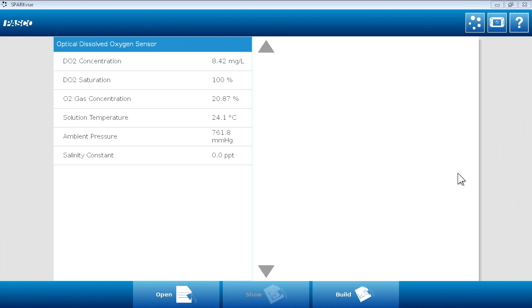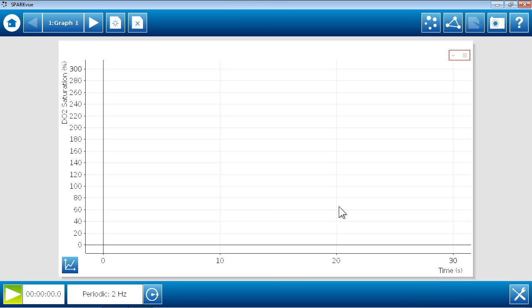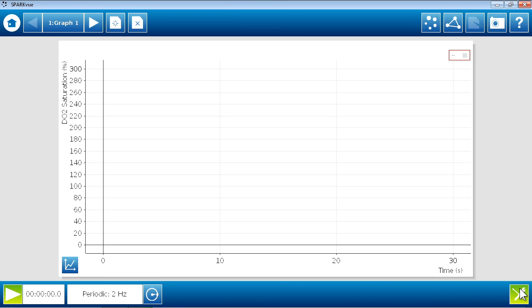To calibrate the Optical Dissolved Oxygen Sensor on the Spark Science Learning System, we first need to open or create a lab file. I'll do this using the show path. Next, proceed to the experiment tools.